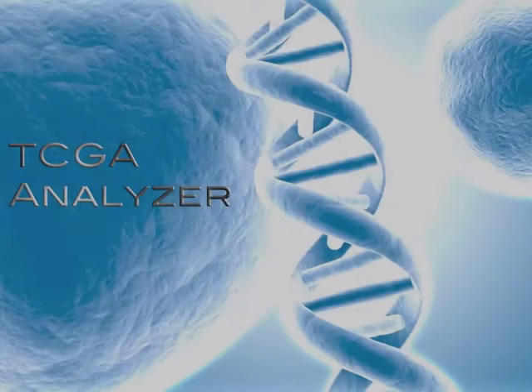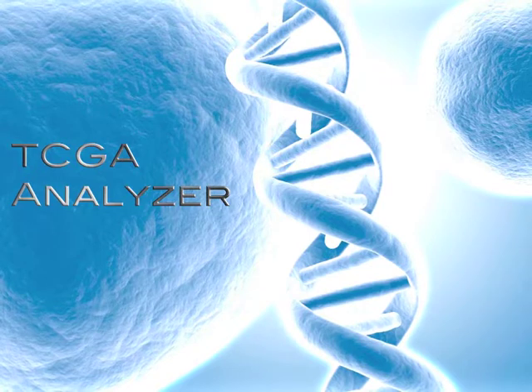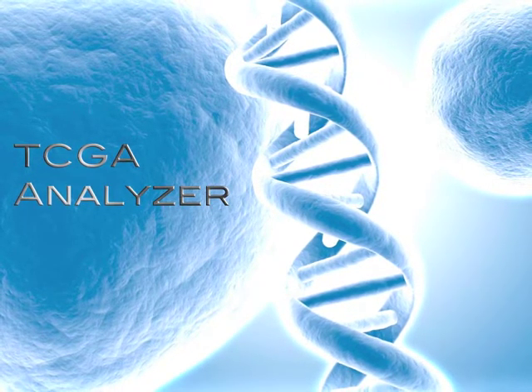This is a demonstration of the TCGA Analyzer software. TCGA Analyzer is software that demonstrates data mining concepts and offers a tool for human genome analysis.